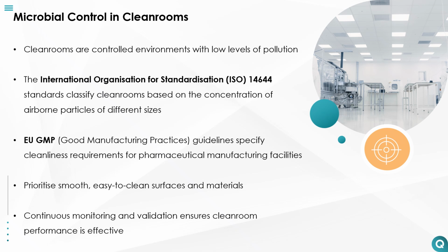Design considerations prioritize smooth, easy-to-clean surfaces and materials that minimize the generation and accumulation of particles, thereby reducing microbial risk. Continuous monitoring and validation are essential to ensure the ongoing effectiveness of cleanroom performance in maintaining low levels of contamination.